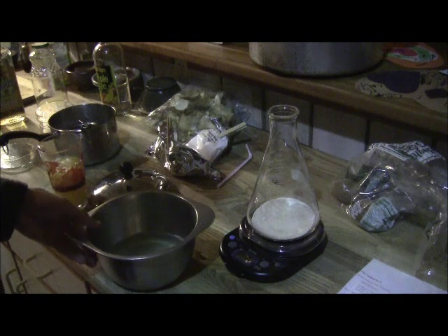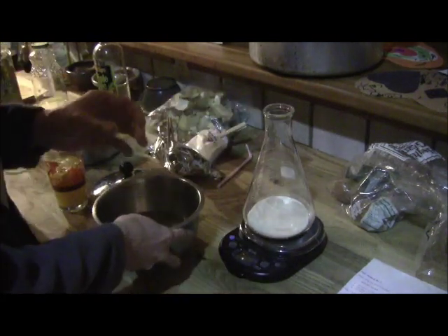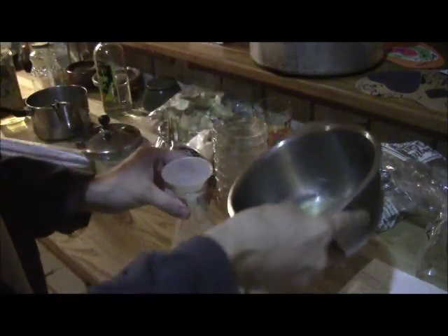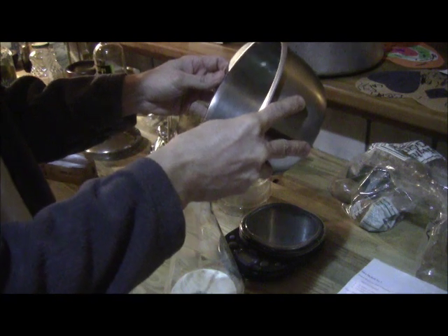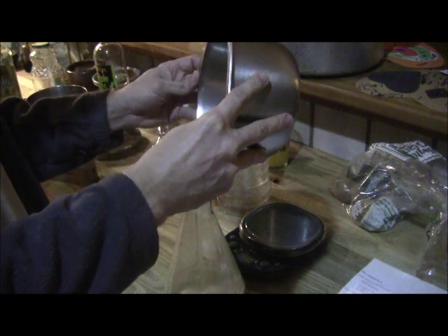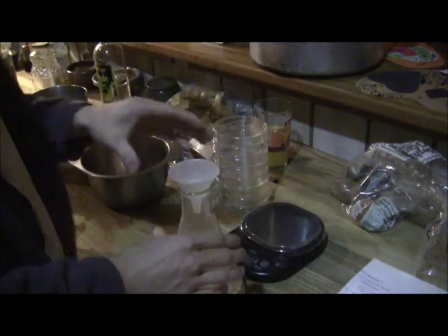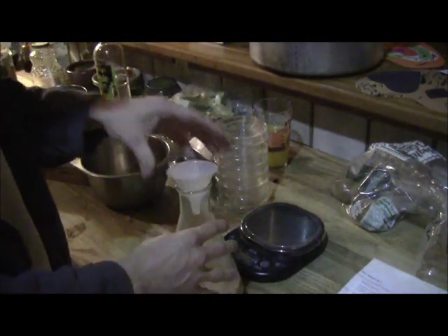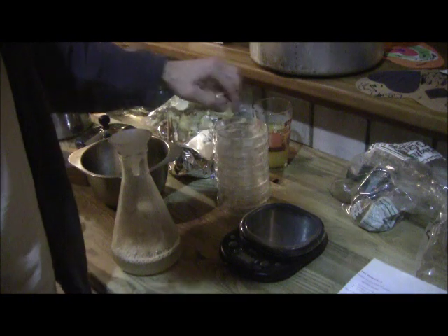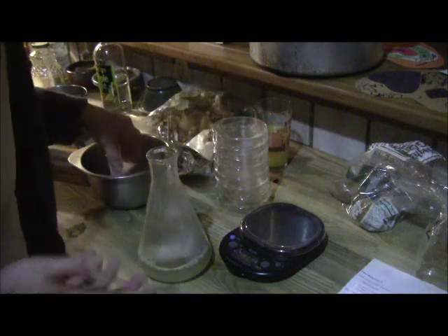The next step is to mix everything together, getting the potato liquid into the flask. I'll grab the funnel and pour it in slowly. Really, we just want to get this liquid in, mixed up, then pressure cook and sterilize it — killing everything in there. Then we'll pour it into these petri dishes. I have about eight here, and with about a pint of liquid you can definitely fill eight, probably closer to ten.